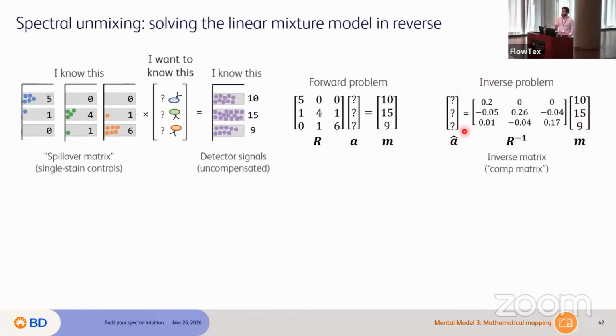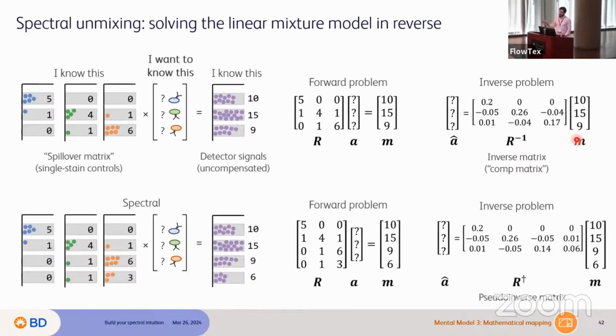So that is literally what your cytometer is doing when you are performing conventional compensation. In the sort of more olden days, when going to two-color flow was a big deal, they actually used analog circuits to do this compensation in real time. I think Bartek actually explained that to me quite a while ago, which I thought was really interesting, and I hadn't realized that. This is how this is sort of done today using digital systems, which most of us are using at this point. Okay, so let's talk about spectral.